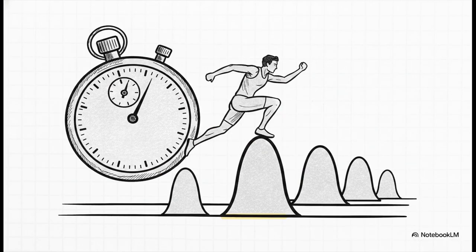On the flip side, we have the retention time, or Tr. This is the specific time taken between the moment of injection and the absolute peak maximum recorded on our chromatogram. This is the runner who actually interacts with the obstacles. And what's absolutely amazing here is that in an ideal case, this specific finish time is completely independent of the quantity of the mixture injected. Basically, a compound is going to have the same retention time whether you inject just a tiny bit or a whole lot.